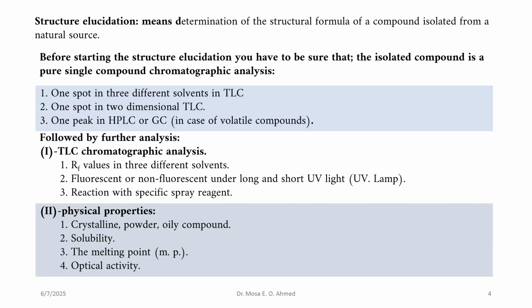Before starting the procedure for structural elucidation, we need to be sure that the isolated compound is a pure single compound. And this is achieved by using chromatographic analysis using various analytical techniques, such as the use of TLC, and we determine the purity by using one spot of sample in three different solvent or different mobile systems.